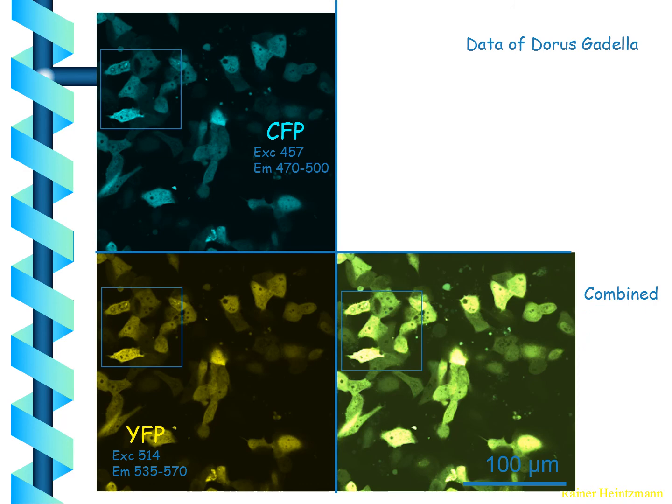I'm going to go back into the acceptor rise a little bit later. And what you see here is some data where this acceptor bleaching has been performed. And so you see here the signals in the two channels, cyan and YFP, before bleaching. And when we now perform the bleaching, we are destroying the fluorescence in this box region, destroying the fluorophores, the acceptors there. And at the same time, as you could see here, was an increase in the donor fluorescence. And you see also in the overlay this increase of the donor.